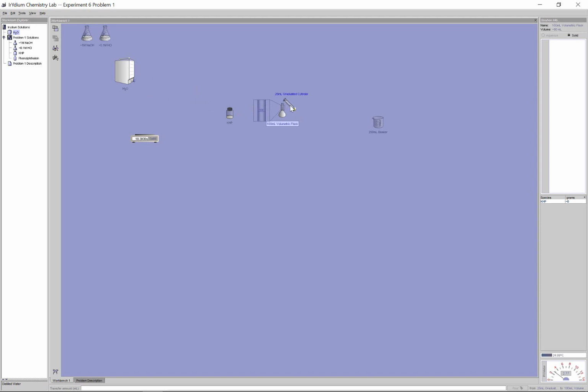Because the graduated cylinder here is a lot more precise than a beaker, I can measure a little bit more fine-tuned increments here. I'm going to transfer in, let's say, 1 milliliter at a time. I can press enter or press pour again. And what I'm looking for here, it'll actually animate if you can see it close enough here. This volume here is steadily climbing. You should see in a second here, this volume here is going to get pretty close to that 100 mark that we're sort of zoomed in at. Even the grad cylinder here is sort of losing its volume.